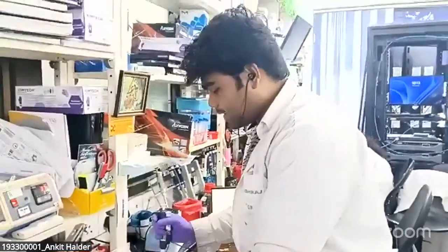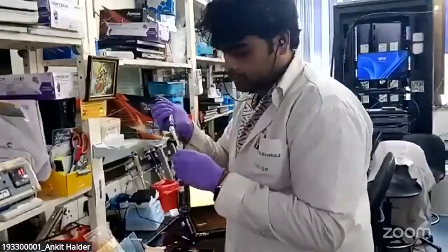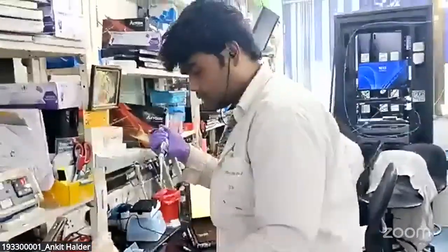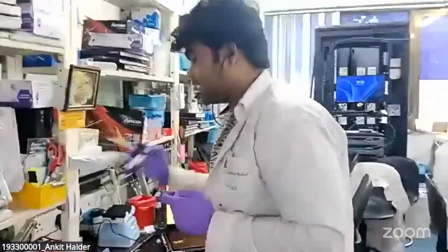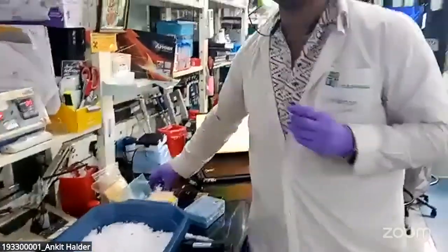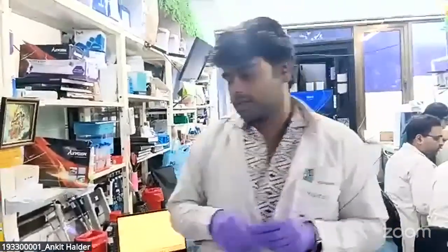Now I'm going to add trypsin. And also after adding the trypsin, we need to keep the pH of the solution at 8. For that, we will again need to add buffer B, and we need to check the pH.